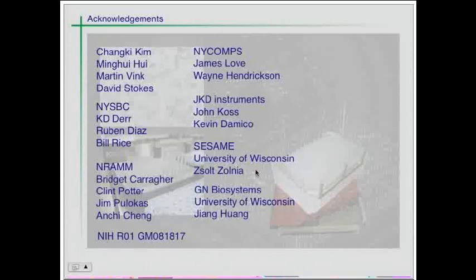But you know, Angie already has a paper in 2007 where they used a liquid handling robot to do the negative staining. You don't blot. What you do is you apply a stain and then you remove. You apply, you remove, and you need to have low concentrations of uranyl acetate and a cycling, an order of events that avoids precipitation. But often we don't even have to do the blotting.